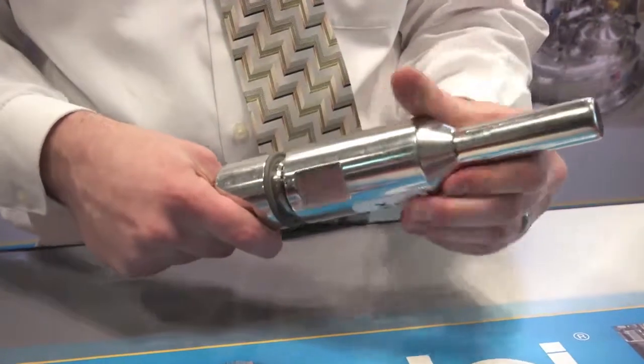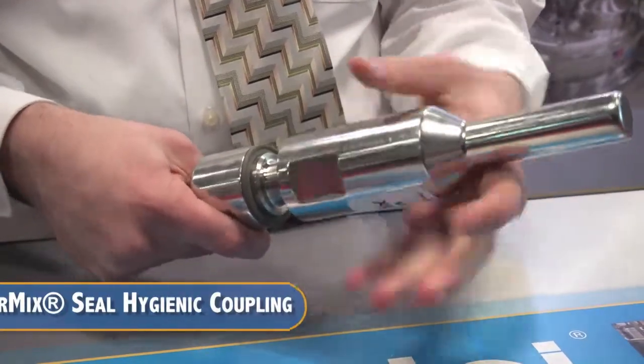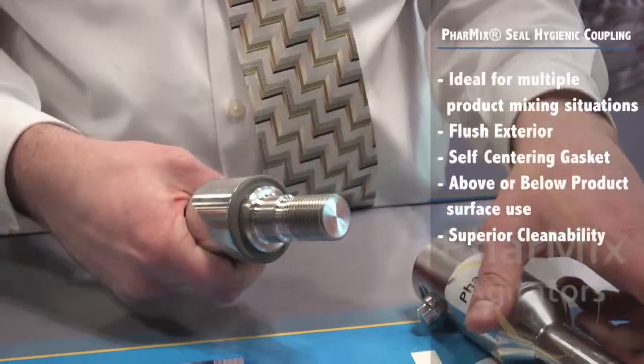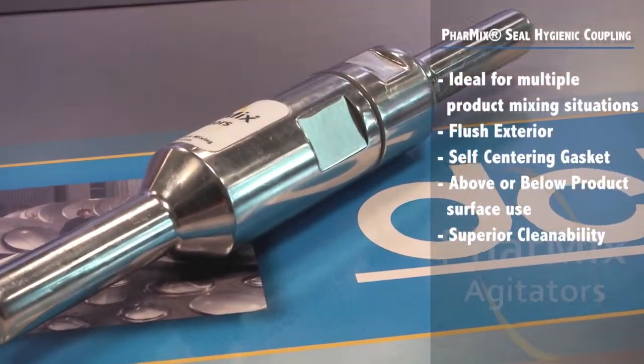Our patent-pending Pharmix seal hygienic coupling is ideal for multiple product mixing where impellers are changed to match processing requirements, or when one-piece continuous shafts cannot be installed. The Pharmix hygienic coupling is supplied with a flush exterior, smooth profile, and self-draining o-ring design.